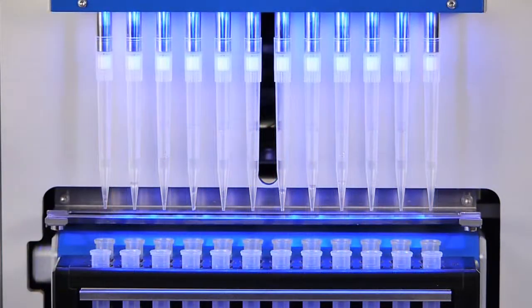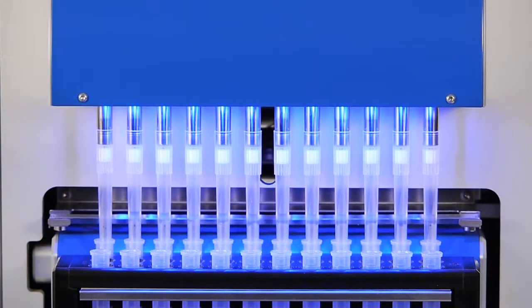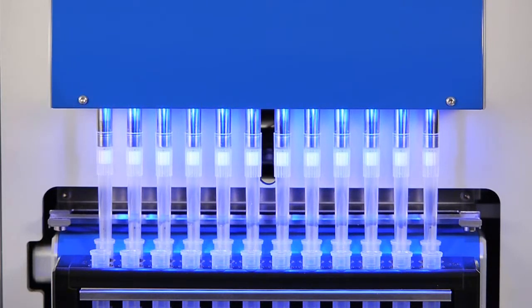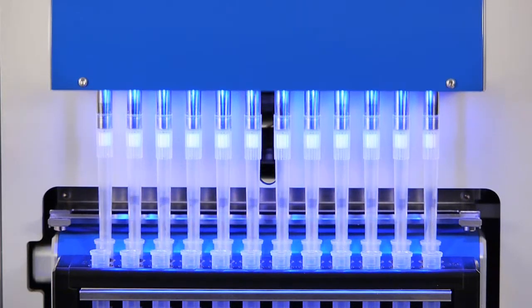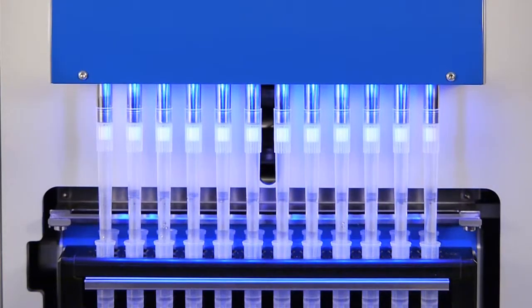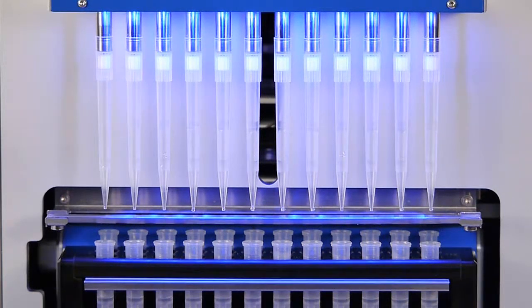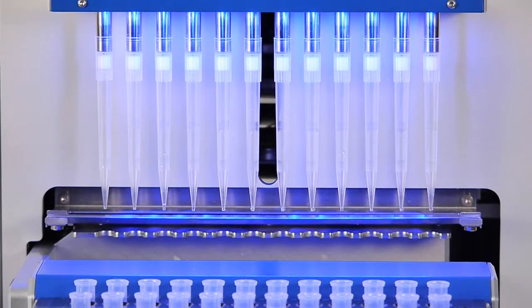Afterwards, elution buffer is added in order to release the DNA from the magnetic beads. This liquid phase now contains the purified DNA. This eluate is finally transferred into the elution tubes, which is then used for the subsequent PCR setup. After eluate transfer, the used filter tips are discarded into the integrated tip waste container.